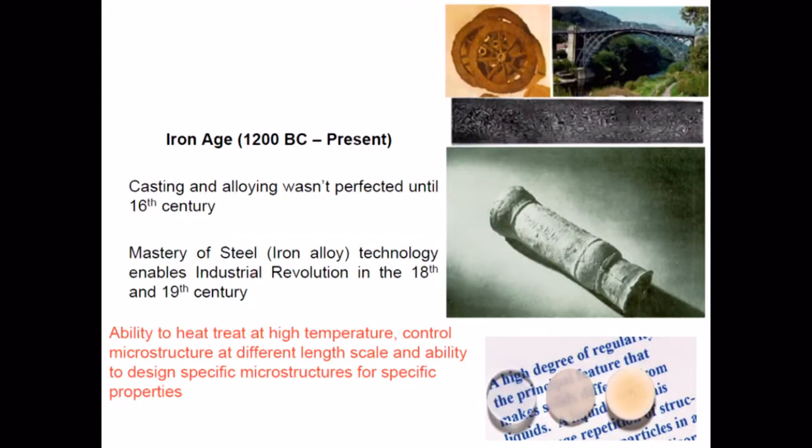You can play with heat treatment. This is a heat treatment of 2000 degrees Celsius. These are all just compacted with the hydrostatic press. We can change the optical and other specific properties by making heat treatment.